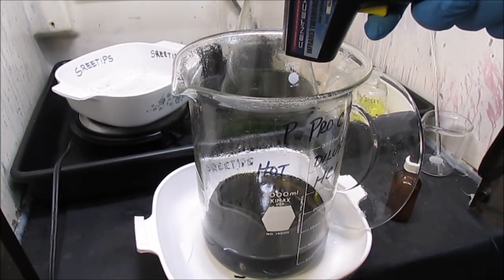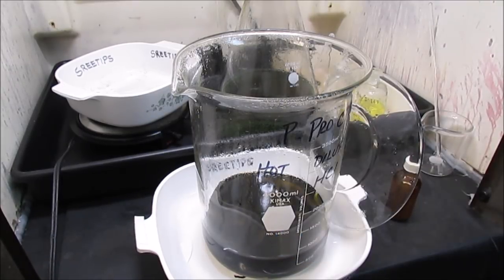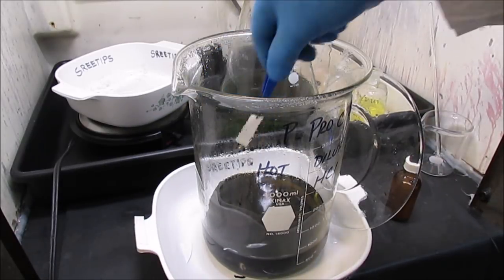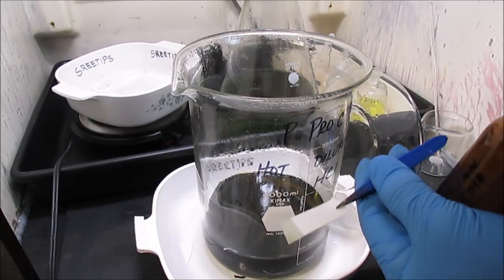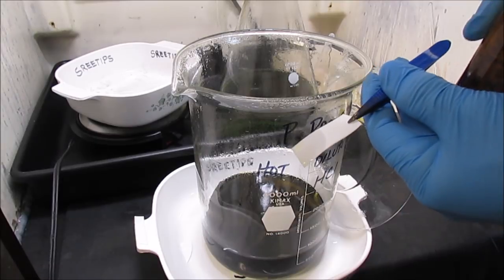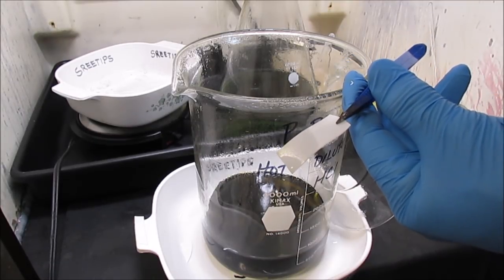Solution has been allowed to cool. It's down to 79 degrees. Go ahead and reach in there and get a little bit on a piece of filter paper here. Do a stannous test, make sure we're not putting anything in solution. And that stannous test is negative. No gold in solution.